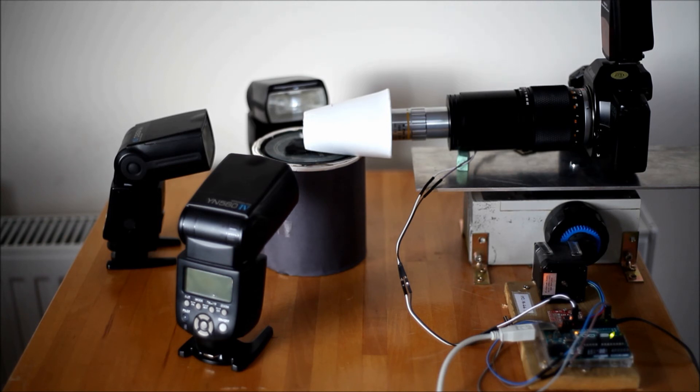This is the focus stacking equipment that we have designed and built ourselves. It is a low cost system based on the BratCam, which was created by Chris Slabaugh. The tiny fern is on a platform under the polystyrene cup on the left. The camera on the right is sitting on a platform that is being slowly winched in a series of steps towards the photographic subject, moving 17 micrometers for each step. After each movement, a photograph is taken. It takes about 40 steps to move the plane of the camera's focus right through the gametophyte fern from the front to the back.